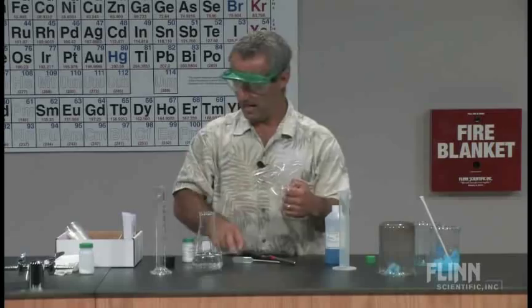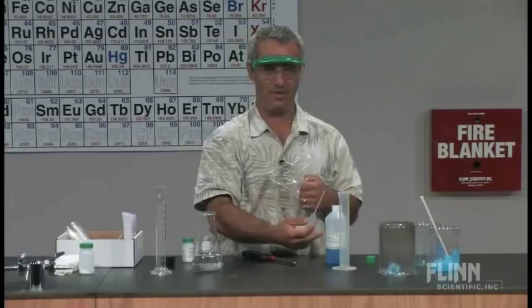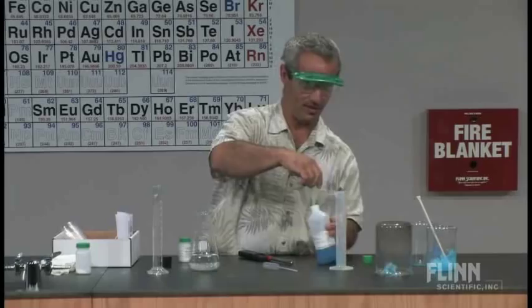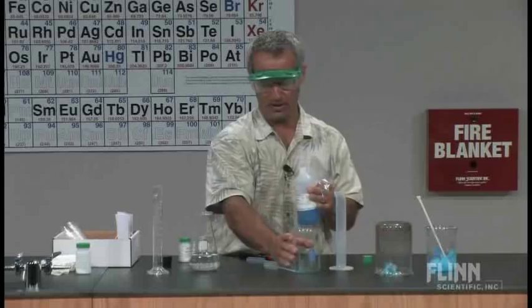And I'm going to use a different pipette for the other one. You know what's going to happen if I use this same pipette to drop the ethanol? It'll clog it up instantly because of the gelling. So I've got another pipette here that's just to be used for the alcohol. I'm going to have to tip this a bit, or pour it into a beaker, easier access.